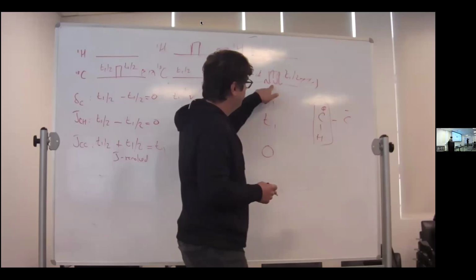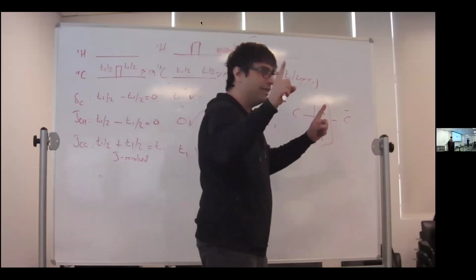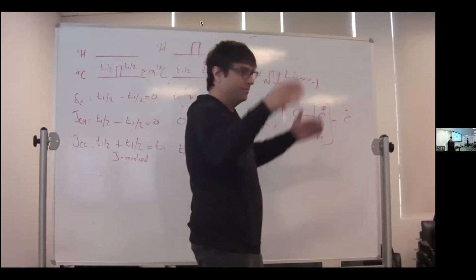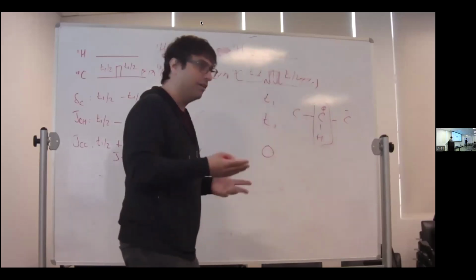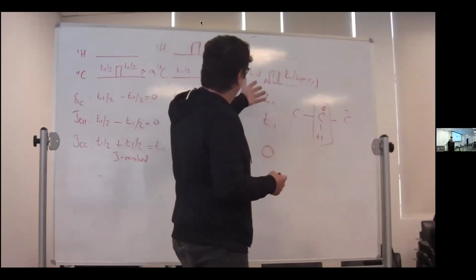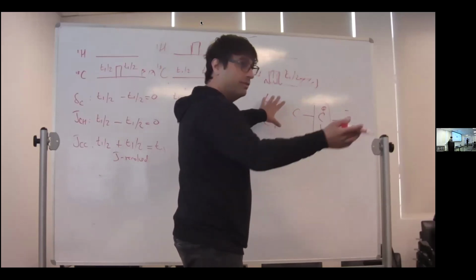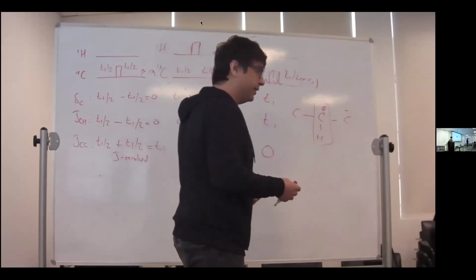Now the problem with this is, what if I have two carbons that I have to deal with? Now I have to selectively hit two carbons, which is really hard, and can get harder and harder. You can always construct, and there probably are other schemes that we could think about. But here's one way to get that CH splitting.